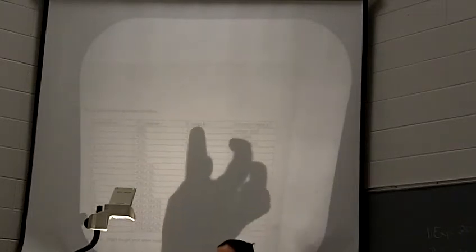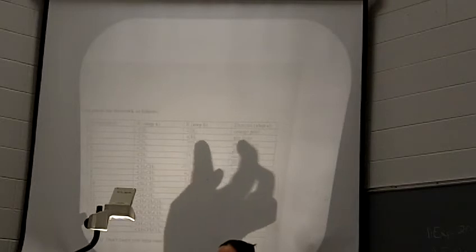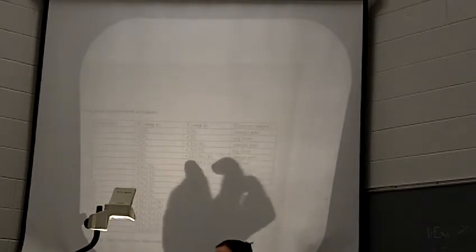Next week, we're going to vary what acid chlorides we're using for the second step, for the formation of the second ester, all right? And so we'll talk about that next week. But as far as what you need to prepare for next week, this will give you the information for which acid chloride you're using. So the methyl is acetyl, the ethyl is propanoyl, and the propyl is butyryl.